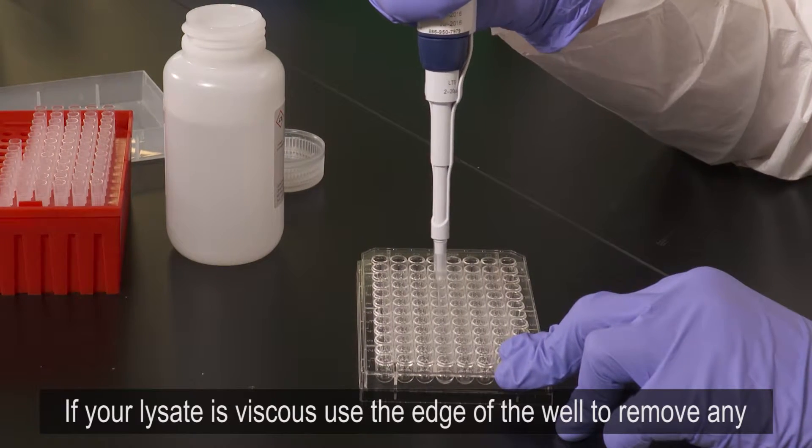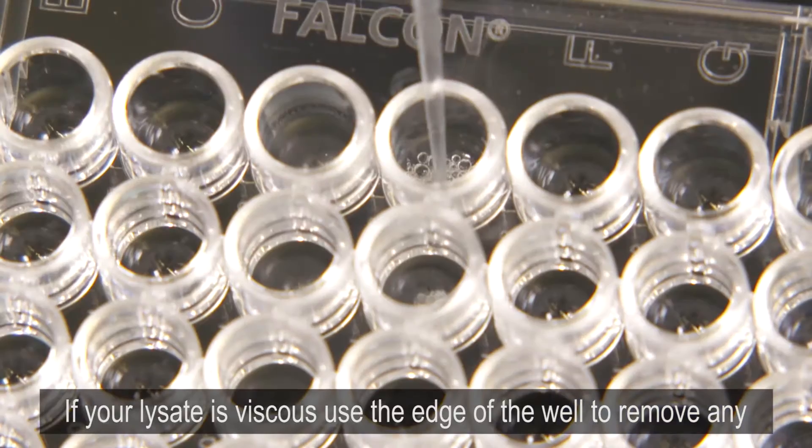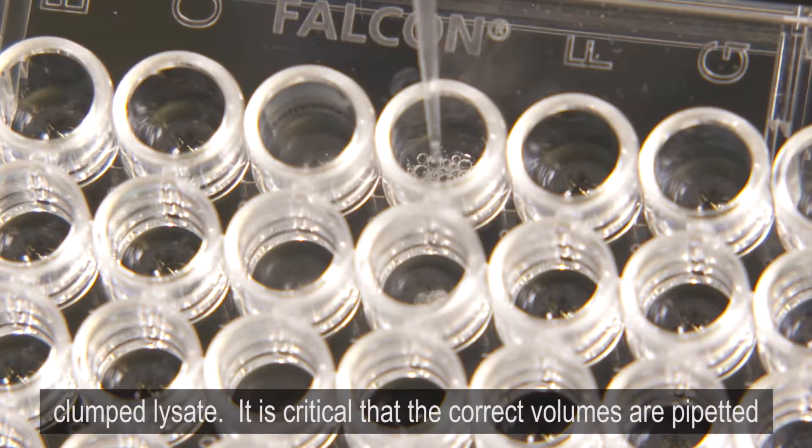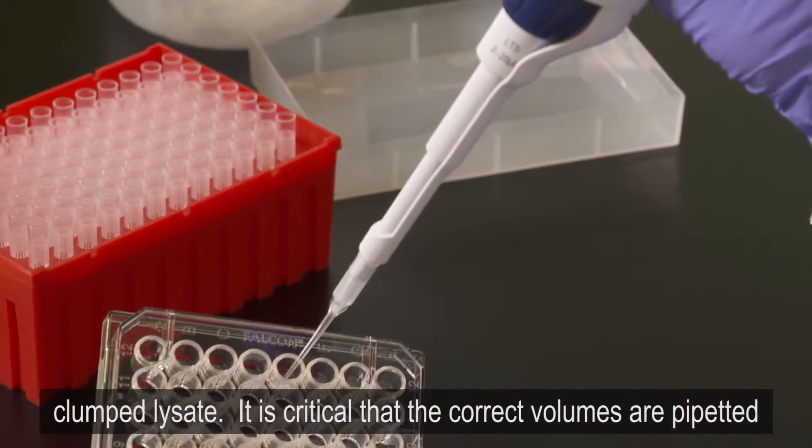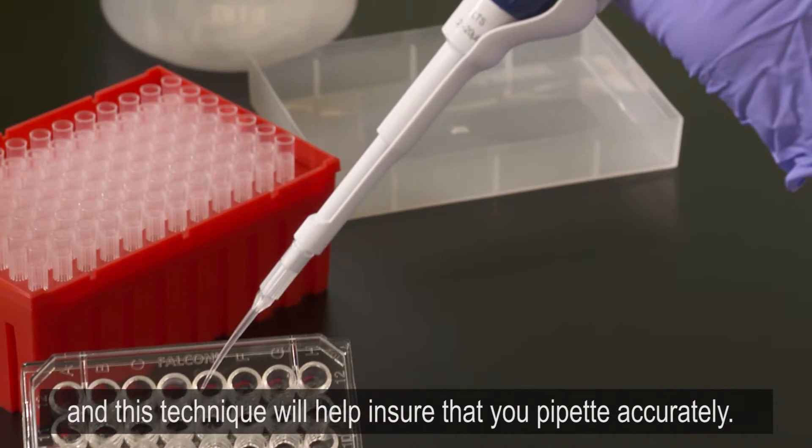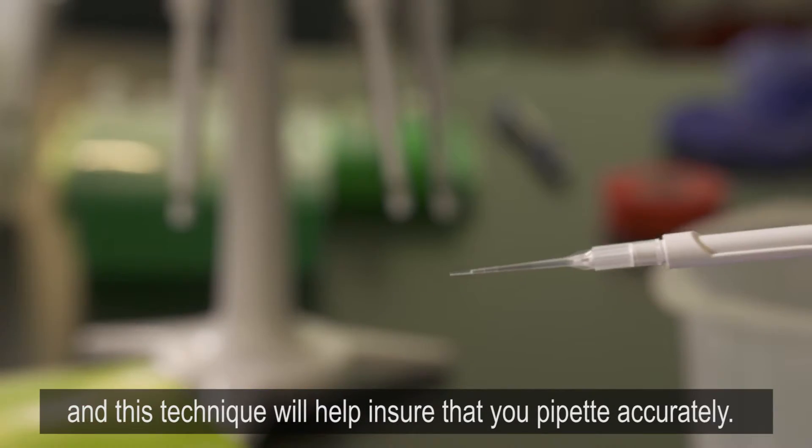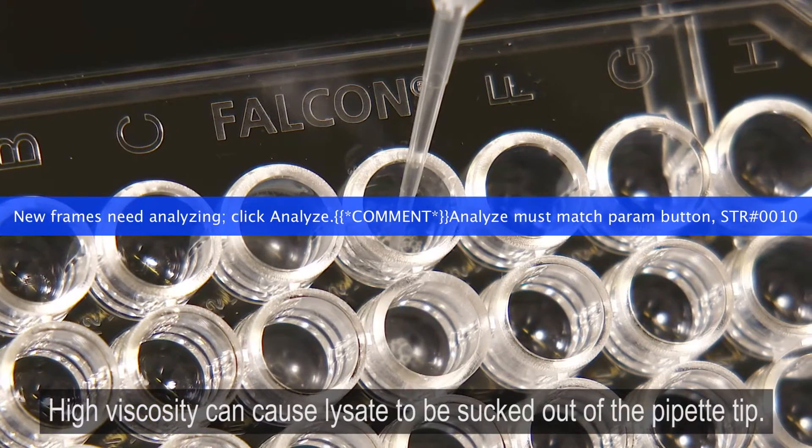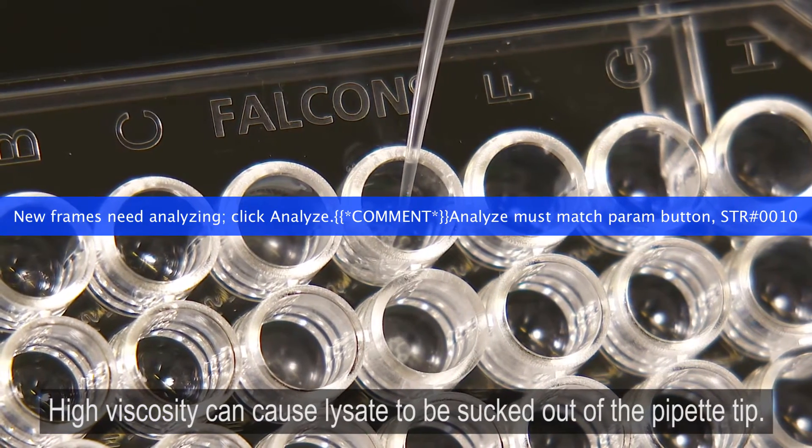If your lysate is viscous, use the edge of the well to remove any clumped lysate. It is critical that the correct volumes are pipetted, and this technique will help ensure that you pipette accurately. High viscosity can cause lysate to be sucked out of the pipette tip.